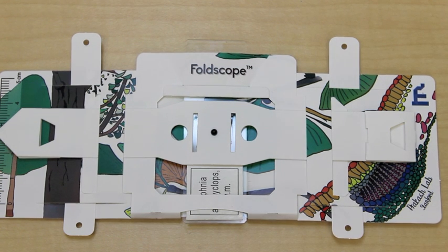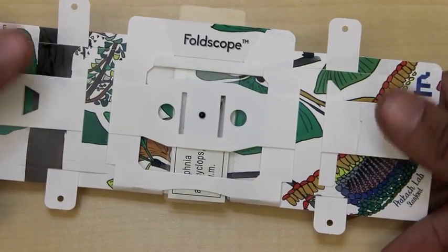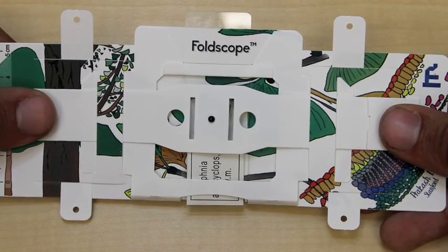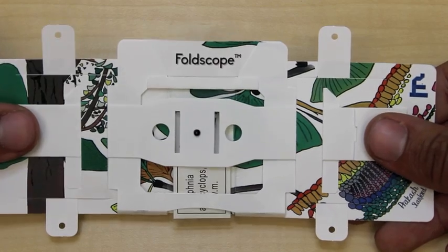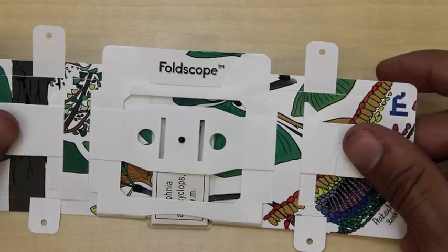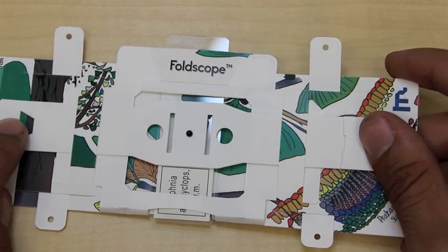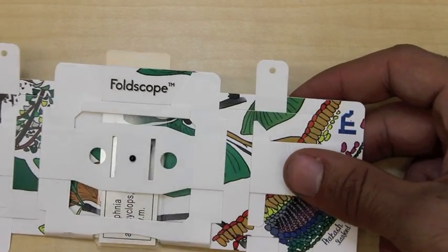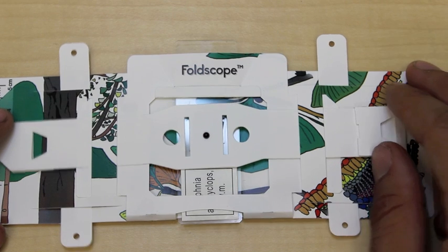Now let's look at focusing. Focusing is achieved by placing your thumbs on these two tabs and either pulling your thumbs apart while keeping the Foldscope flat, or pushing your thumbs together while keeping the Foldscope flat. What this does is it flexes the strip that holds the lens, and when you flex the strip, it moves the lens closer to or further away from the sample, which brings it in and out of focus.